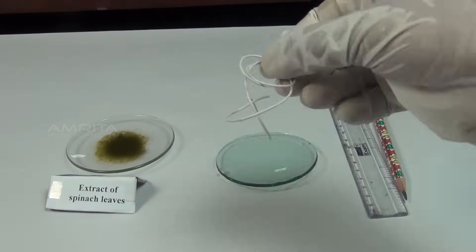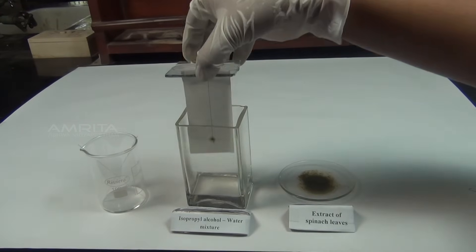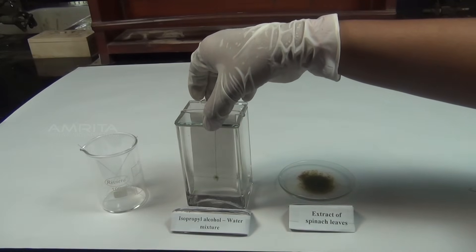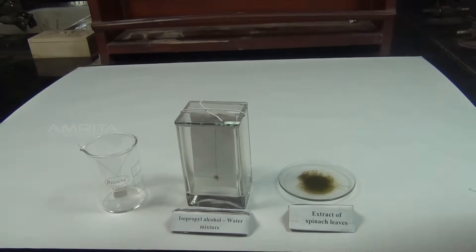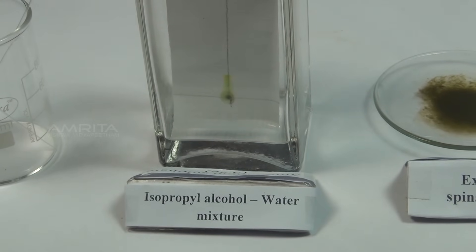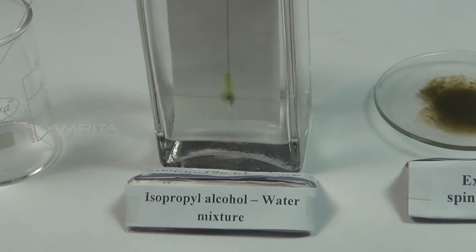Take a piece of thread and tie the filter paper with it. Suspend the filter paper vertically in the chromatographic chamber containing solvent, which is a mixture of isopropyl alcohol and distilled water. Make sure that the pencil line remains about 1 cm above the solvent level. Keep the chamber undisturbed for some time.